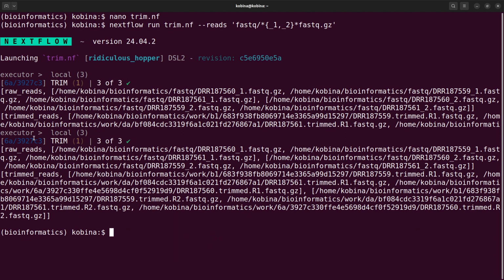Of course, with the view, because Nextflow does parallel processing, some of the information will come first before the other. And so ideally what we should do is to sort them, but nevertheless, this one should also work fine for us. So we group them first and then we can now do the activities. We are going to see something like this, but it's fine. We will proceed because whatever we have there, it's fine.